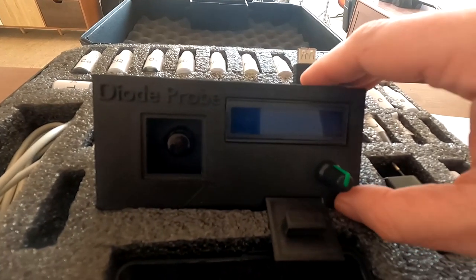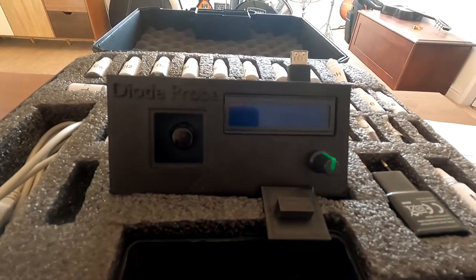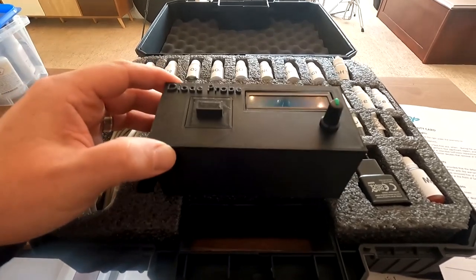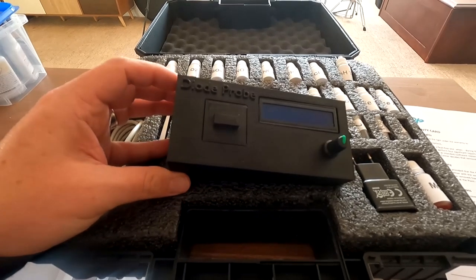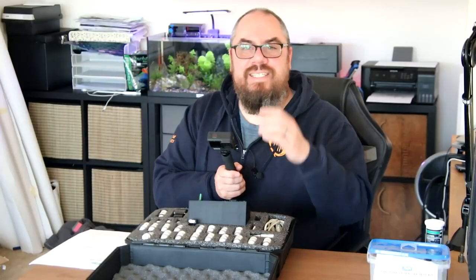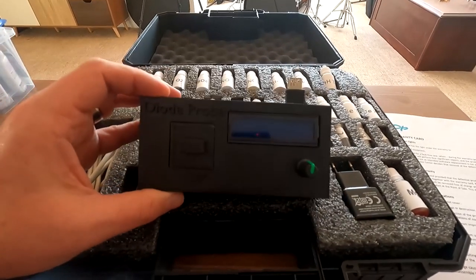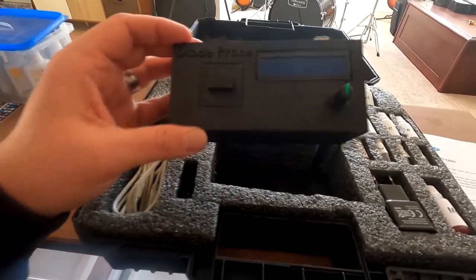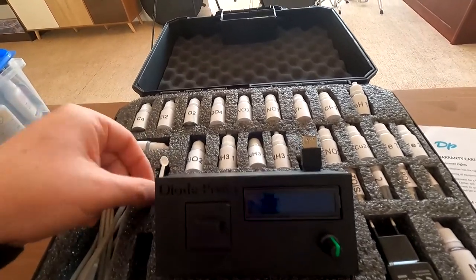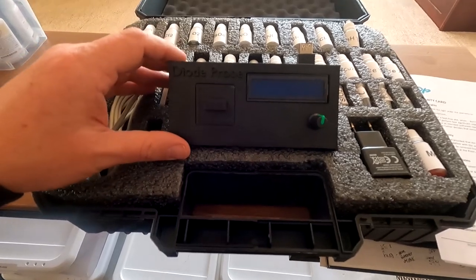I thought I'd take you through how to use it, how simple it is, how accurate it is, and whether it's worth looking into. Looking at the construction, it's like a 3D printed box — it's still in development. I've had emails back and forth with the makers, and there are newer versions. For instance, in my version I have to do some multiplication for nitrates, but that's been sorted in the version you'd buy today. It comes with all the reagents and a little test tube.